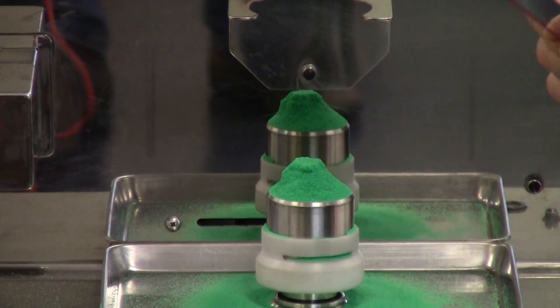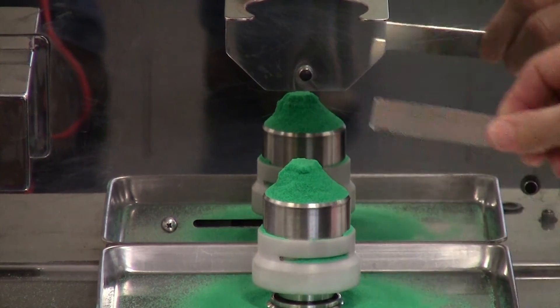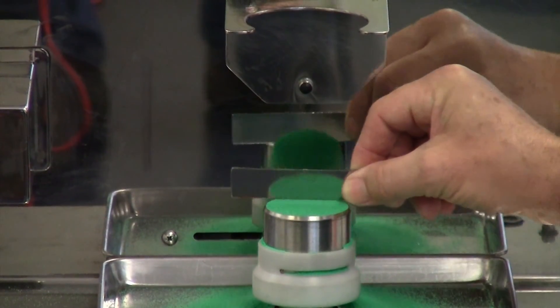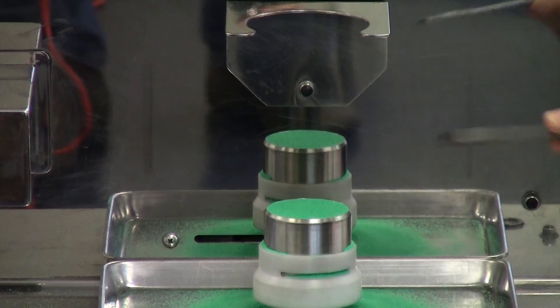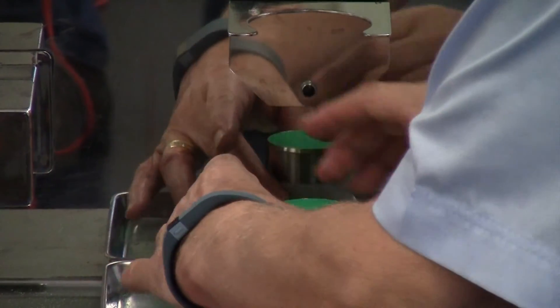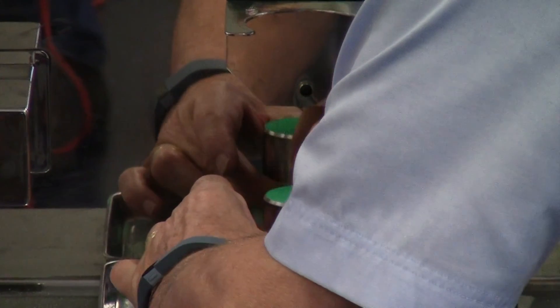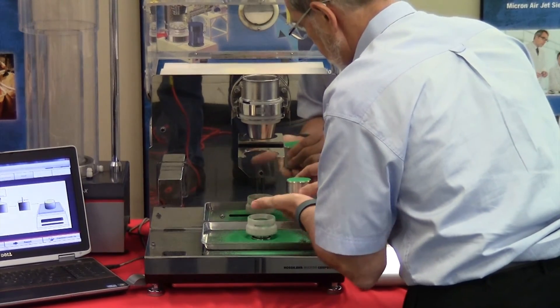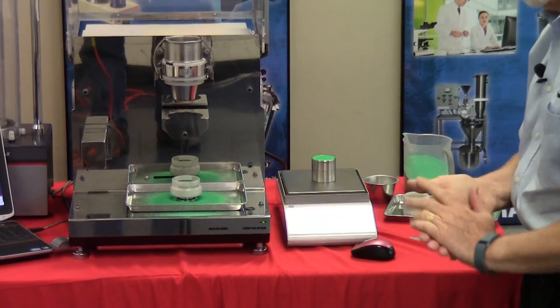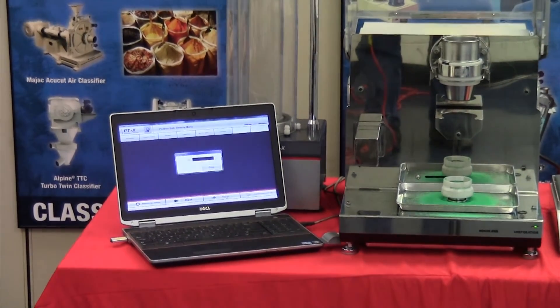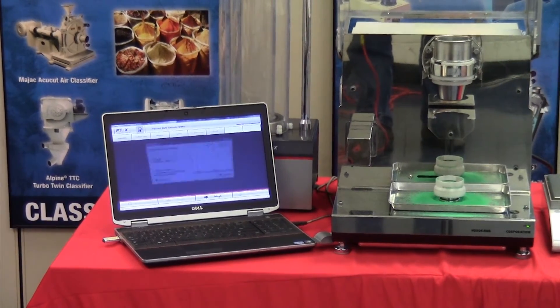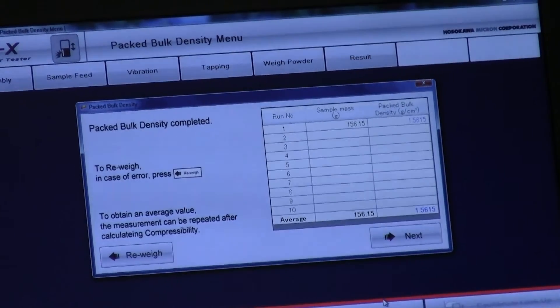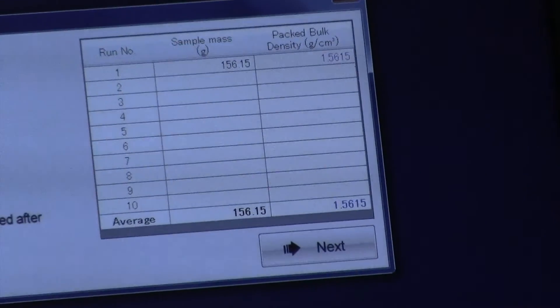Unlike the aerated density, because we've tapped out all the air, we can go vertically down to scrape — sawing across just to get a nice level surface. Try not to cavitate the material, then simply remove the cup from the holder. Make certain there's no excess material on the sides, place the cup on the balance, and press next. The density for packed is 1.561 grams per cc.